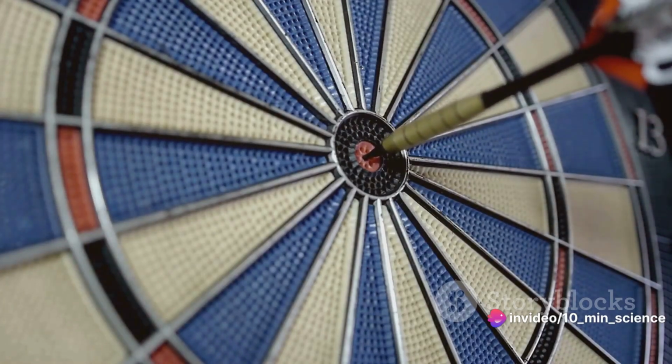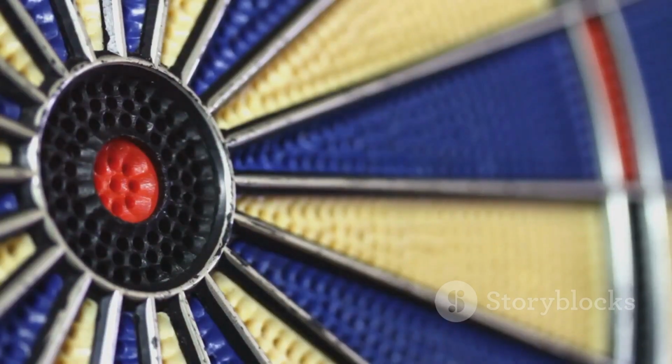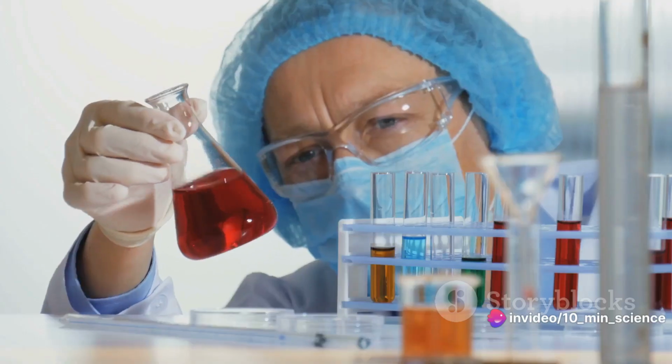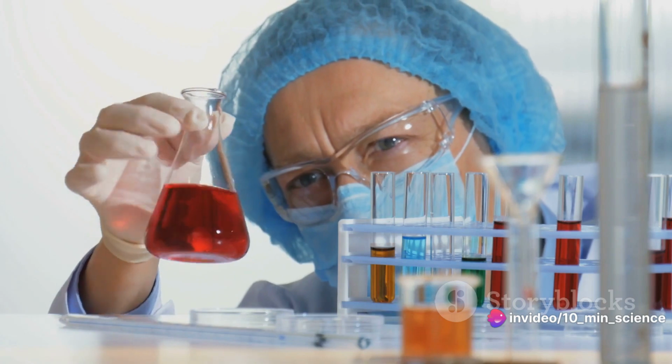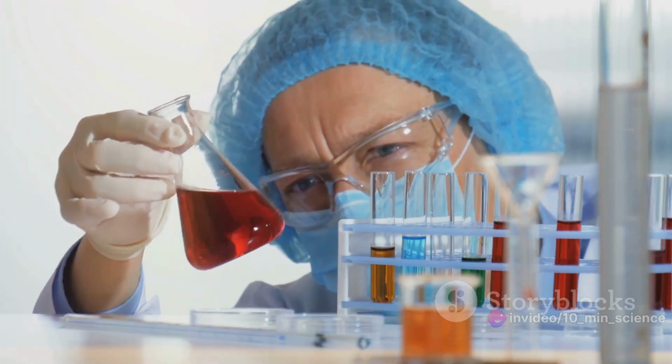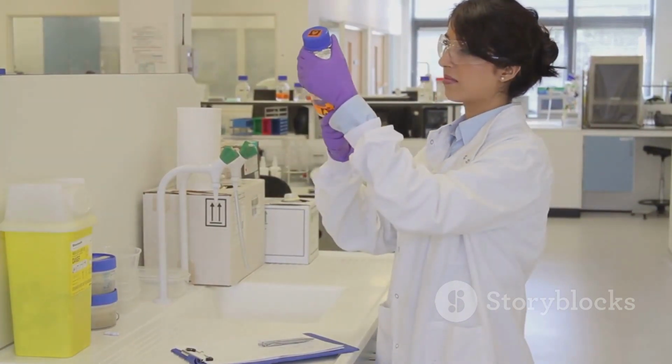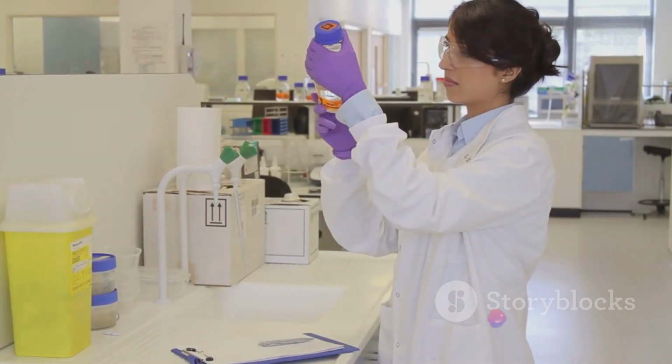We then explored the pivotal role of internal standards. They are not merely bystanders in the HPLC process. They are active participants, helping to correct for losses during sample preparation, variations in injection volume, and fluctuations in detector response. They are the guardians of accuracy, impartial in their duty, and unwavering in their commitment to reliable data.